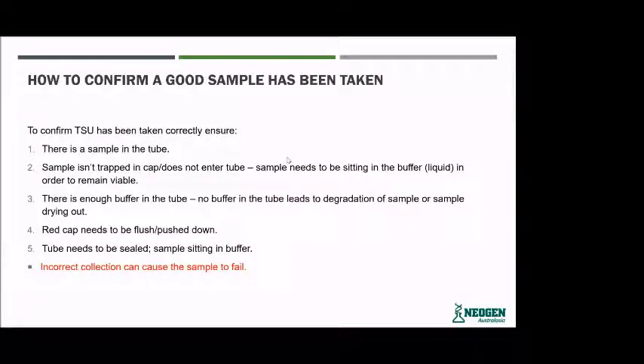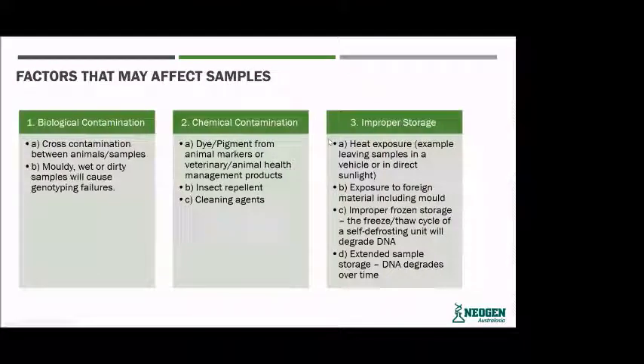Incorrect collection can also cause sample failure within the lab. There are a few different factors that influence the quality of a sample. The first one is biological contamination — cross-contamination between animals and species. Mouldy, wet, or dirty samples will cause genotyping fails as well.